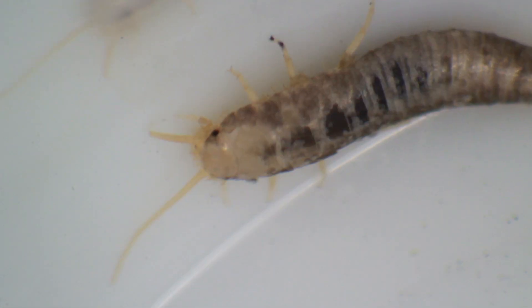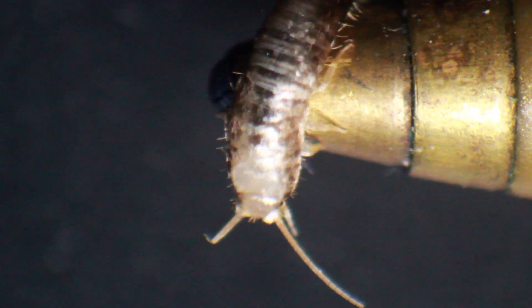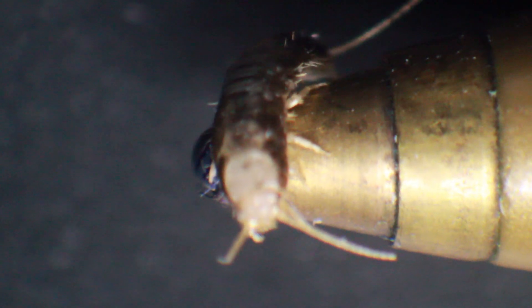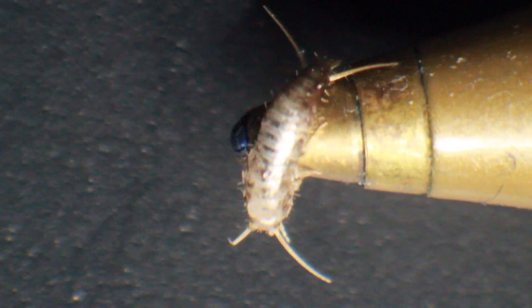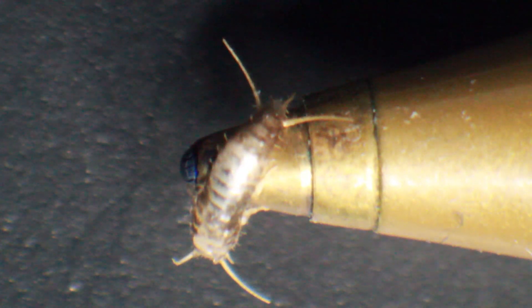They are approximately one to one and a half centimeters in length. Silverfish are not known to transmit any diseases, so I wouldn't worry too much about them, though I understand some people don't like them. Here I have it on my ballpen - it's sitting and resting, doesn't move around much. Maybe it doesn't like the light, but it's also realizing it cannot really escape.